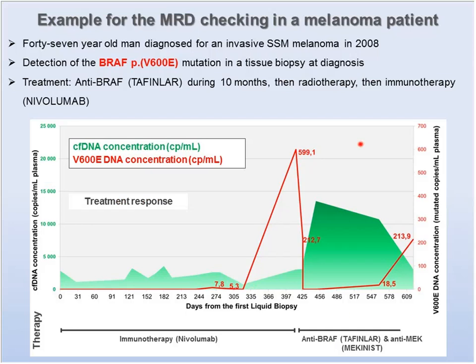So just after, we observed that the mutation dropped, and on the opposite, we observed a strong increase of the cell-free DNA concentration.